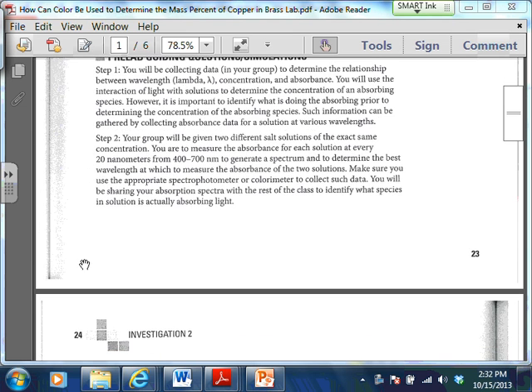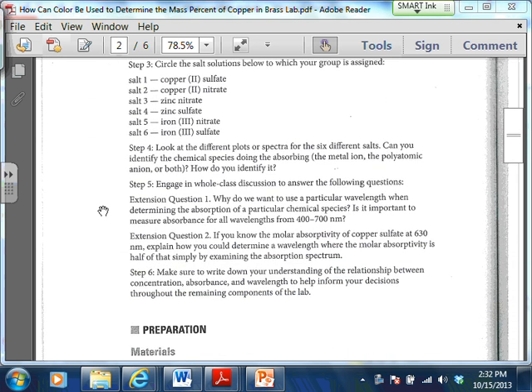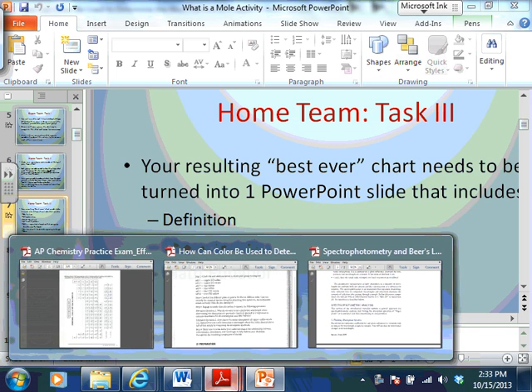So basically what we did in the lab today is you measured your maximum absorbance and the wavelength that that happens at, okay? That gives you an idea of what type of light you're absorbing most of with each of these compounds. So if we look at the copper sulfate, just looking at your data, I'm going to average these a little bit here.